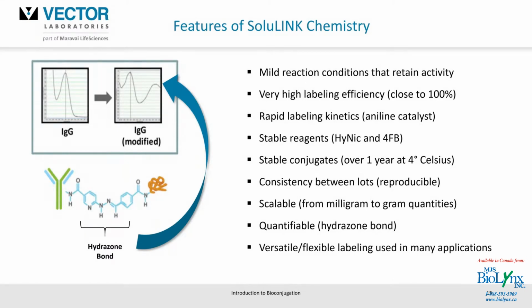And if you think back to the slide we mentioned about the bioconjugate applications with the image of the cell there, all of those particular methodologies we listed, flow cytometry, microscopy, etc. This particular bioconjugation methodology can be used in those studies.